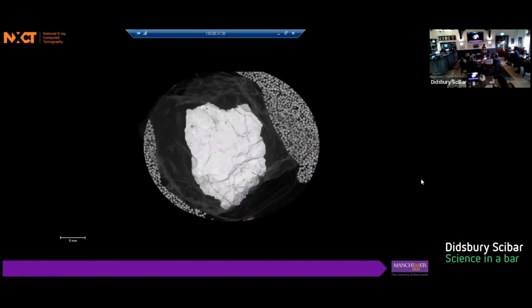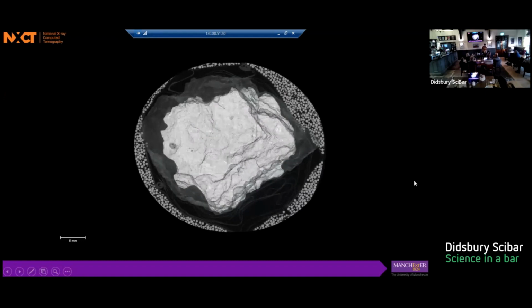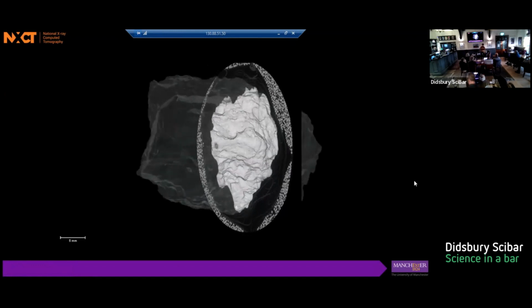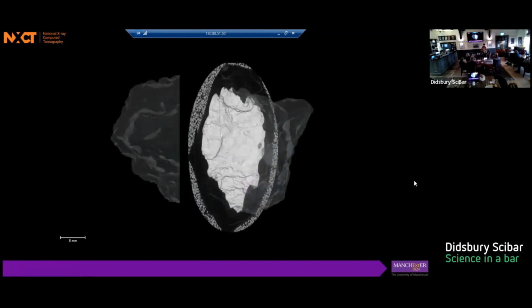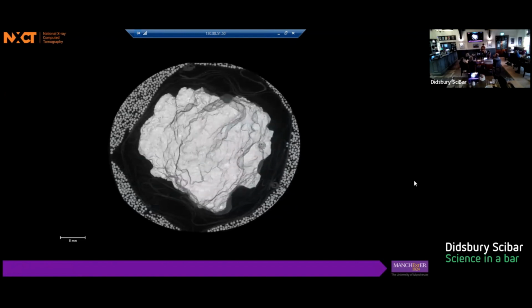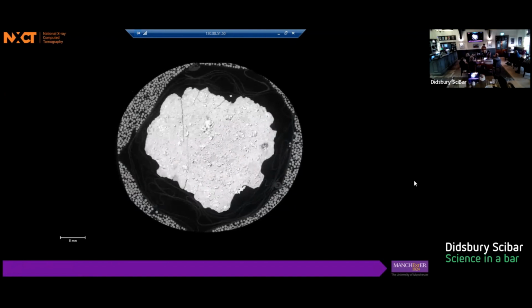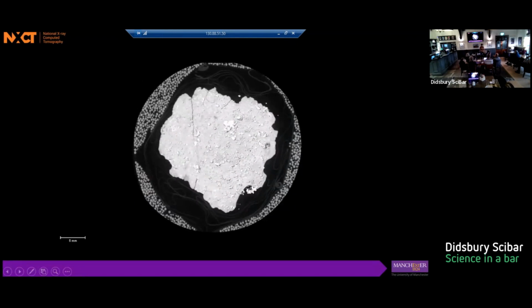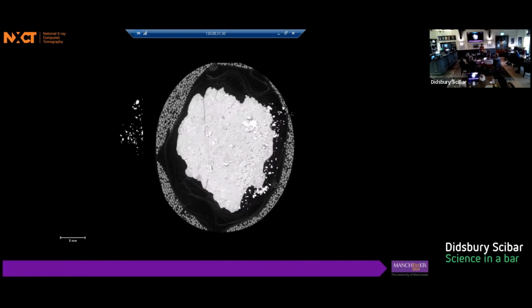resolution possible. So you might think it's a bit odd, the fact that it appears to be surrounded by ball bearings. But the reason for that is actually to help with the CT scanning, because the more cylindrical an object is, the better it scans. So the moon rock itself was packed inside a cylinder, the hollow spaces were packed with ball bearings, and as a result, it produces a much cleaner image, so we can get a feel for all the different mineral phases that are inside this lovely moon rock. And although the grayscale of an X-ray doesn't give you chemistry, you can infer things like the mineral of a rock.